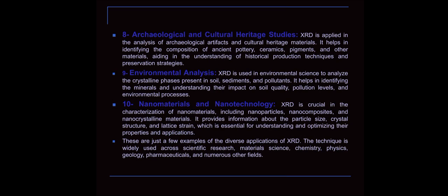Now, eighth one, archaeological and cultural heritage studies. XRD is applied to the analysis of archaeological, archival, and cultural heritage materials. It helps in identifying the composition of ancient pottery, ceramics, pigments, and other materials. Ninth one, environmental analysis. XRD is used in environmental science to analyze the crystalline phases present in soil, sediments, and pollutants.